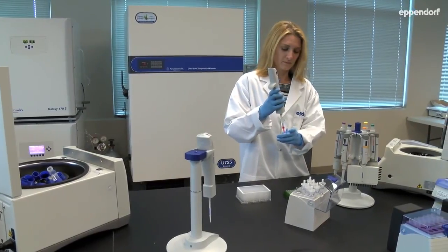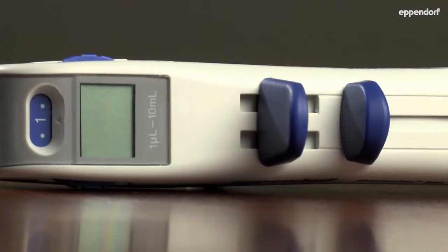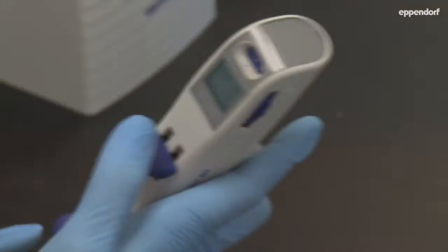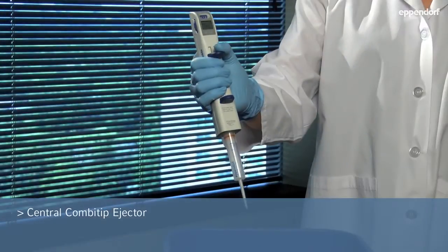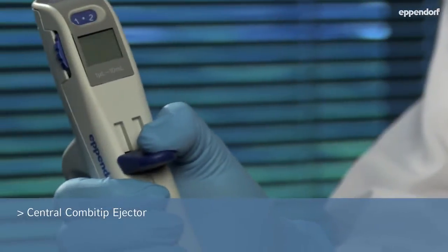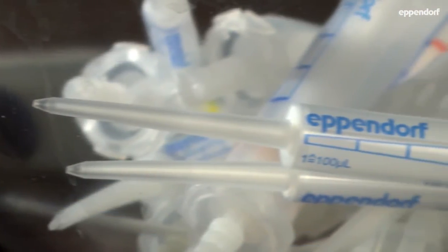The built-in motion sensor powers down the Multipet M4 when not in use and boots the device up with minimal movement. When you're all done, the centralized ejector allows for quick disposal of the CompiTips Advanced, mitigating the risk for contamination.